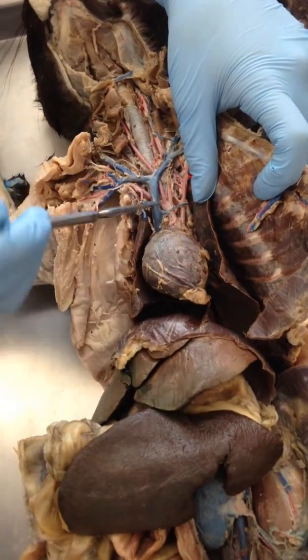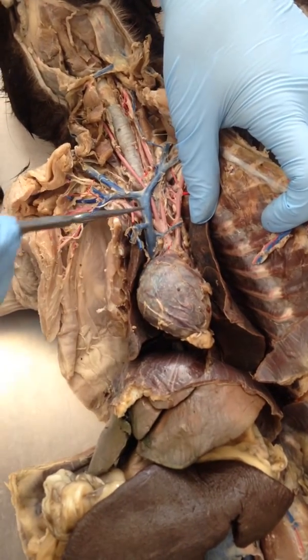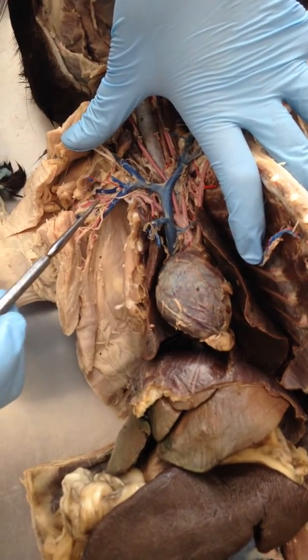Coming off is the aorta, and this is the brachiocephalic. It goes into the carotids, the right and left. And then these are the subclavians right here, and it becomes the brachial down here. Brachial. I'll put an N in there.